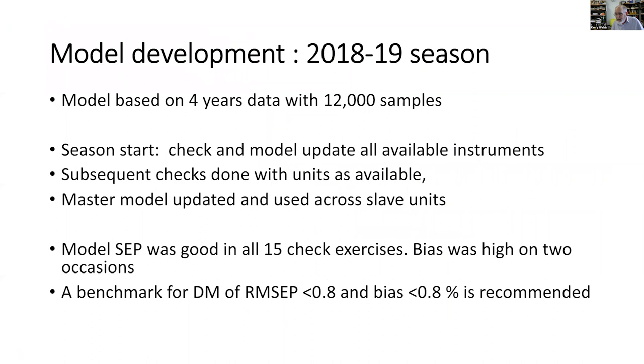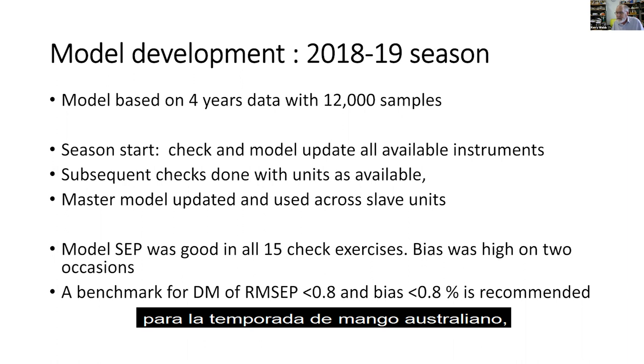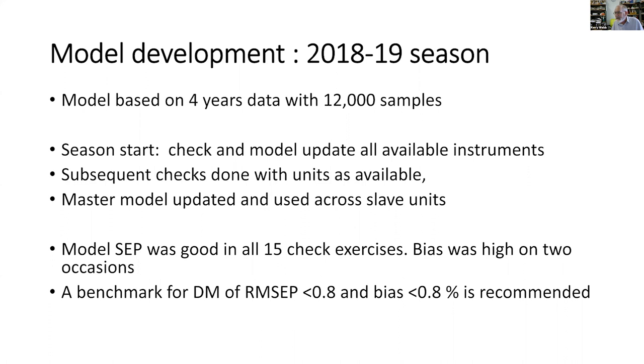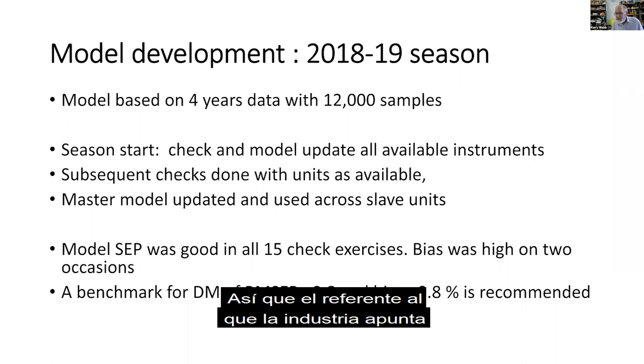The model in use in Australia is now based on 4 years' worth of data. There's over 12,000 reference analyses associated with that. The season starts, and the season is just starting now for the Australian mango season. All instruments in the country are gathered together across the industry. It's a voluntary system, but people, if they wish, will send their instruments in, and there is a calibration quality control check done. And if needed, the model will be updated. Now that model has been developed across several years, it's quite stable. Last year, for example, the model SEP was good in all 15 check exercises that were done across the season. Bias was high on two occasions, though. So the benchmark that the industry aims for is an RMSE of less than 0.8% dry matter, a bias of about 0.8% or less.